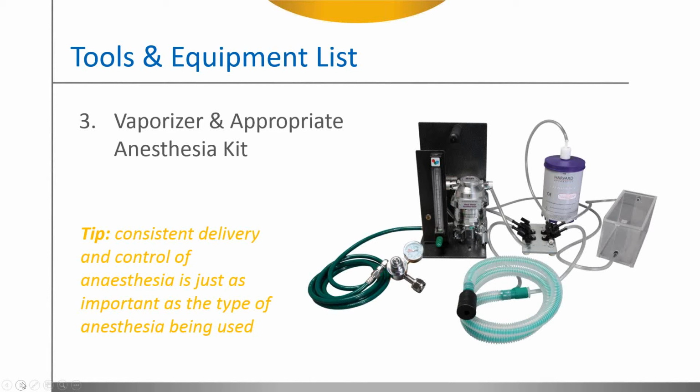Similarly with vaporizers and anesthesia kits. The thing to keep in mind is that consistent delivery and control of anesthesia can be just as important as the type of anesthesia that is being used.